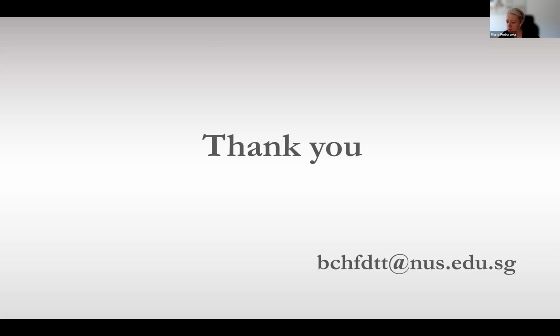I do agree with you completely. I think the main point for DDA versus DIA is the availability of the tools to actually deal with the data, right? So the convoluted data, I think it's still quite problematic. The other question also here is about whether it is mandatory to use pooled quality control samples to check data integrity.